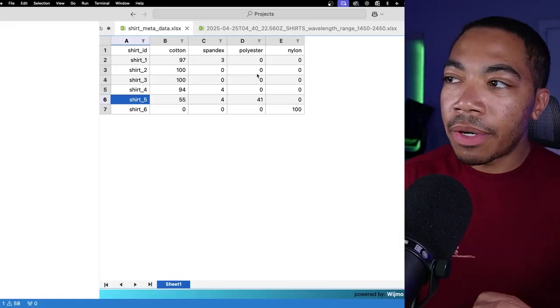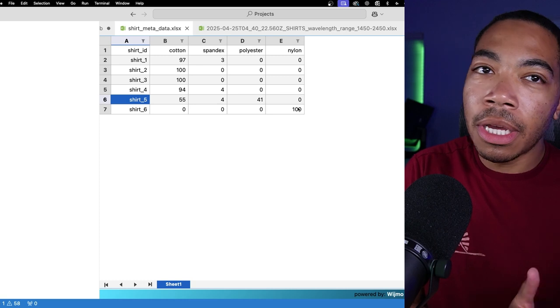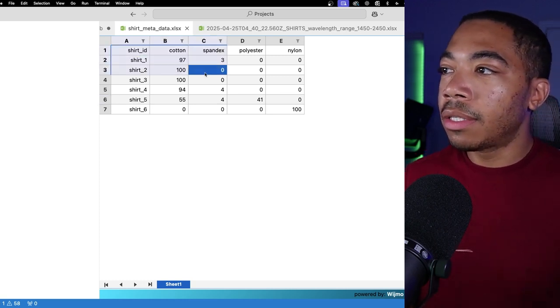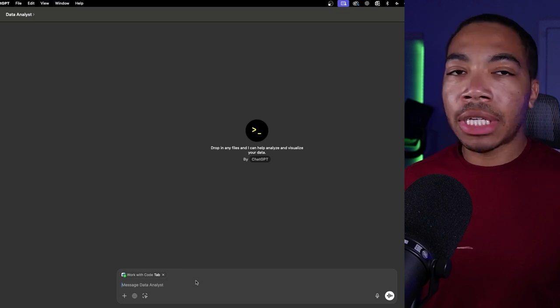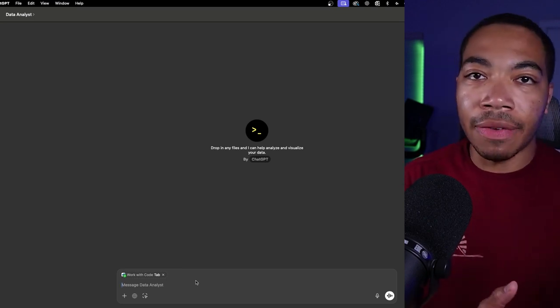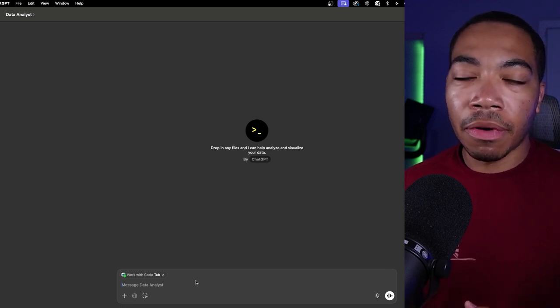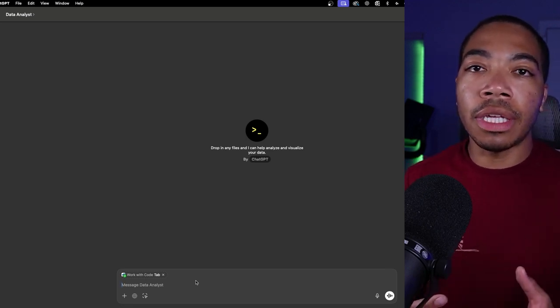And so the first thing I want to do is actually perform agglomerative clustering, but I want to go the no-code route, with a slight tweak. So let me just copy these results here first. And I'm going to use ChatGPT to perform my agglomerative clustering. So I'm going to ask it to activate this data by first copying this data in and then prompting it to perform agglomerative clustering on this table.